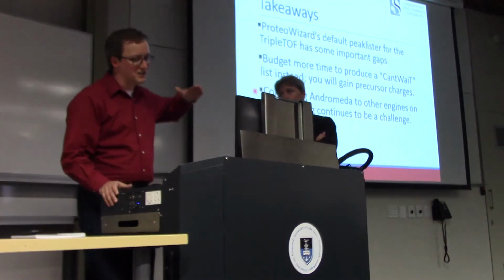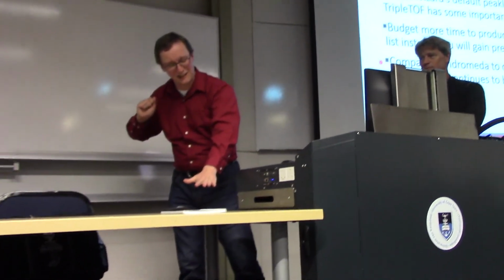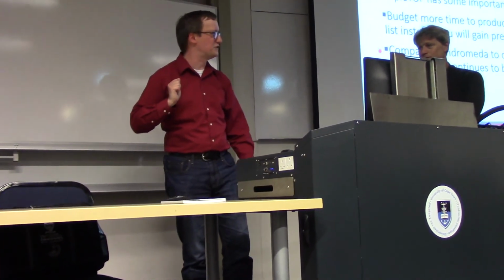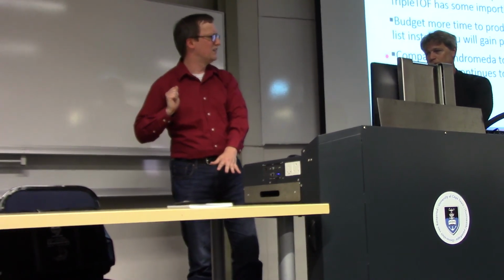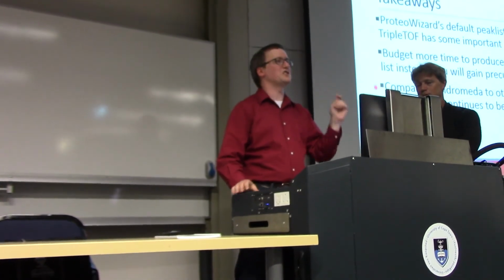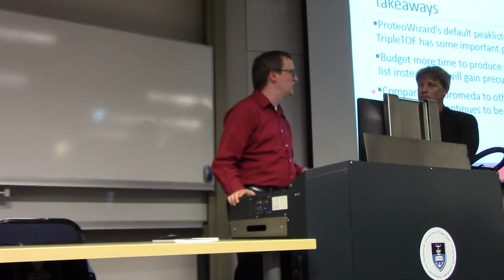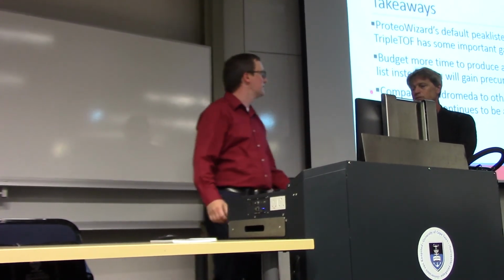Now, once you get to maximum sensitivity, now you're looking at really awful signal-to-noise ratio. I don't understand all the things that go into the spectra that appear there. But I would say that if you just want to use this as a great shotgun instrument, you won't be disappointed. It's probably on the same level as a Q Exactive.